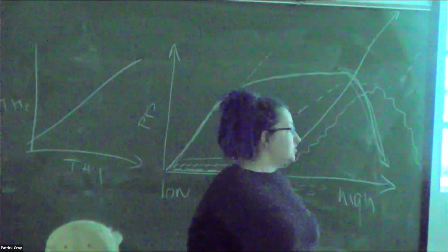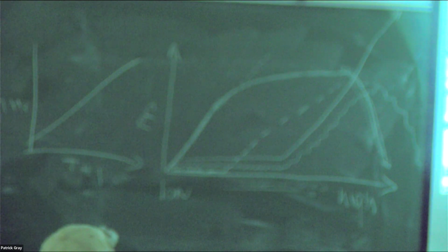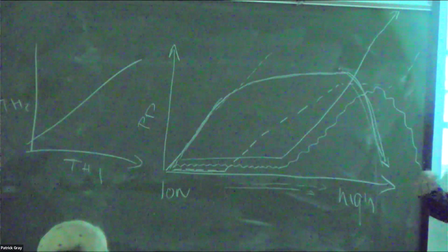Okay, so now when I told you all these crazy things that can happen, it's the same formula, it's still the same thing. If I shoot a known light, chlorophyll is going to absorb it. We can calculate chlorophyll, yeah? That was when it was sitting in the acetone. Now we know it gets quenched, so here it's chlorophyll fluorescence in vivo, from the EcoPuck, divided by the chlorophyll that I measured in acetone.